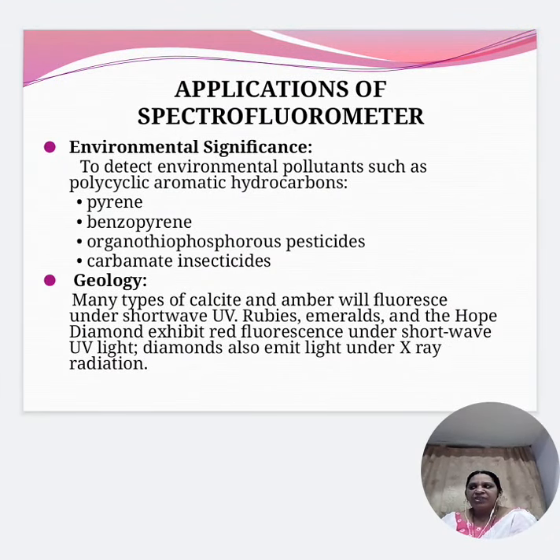So coming to the applications of spectrofluorometers. There are several applications where we use spectrofluorometers. Environmental significance: spectrofluorometers are used to detect environmental pollutants such as polycyclic aromatic hydrocarbons, like pyrene, benzopyrene, organothiophosphorus pesticides, and carbamate insecticides.